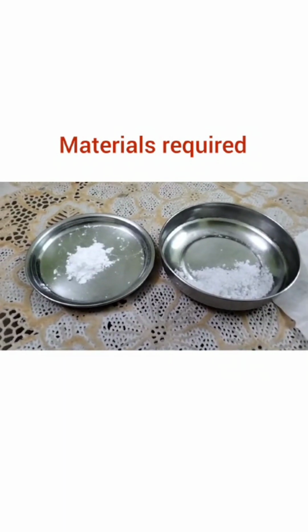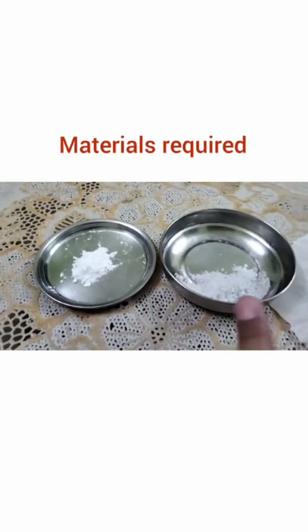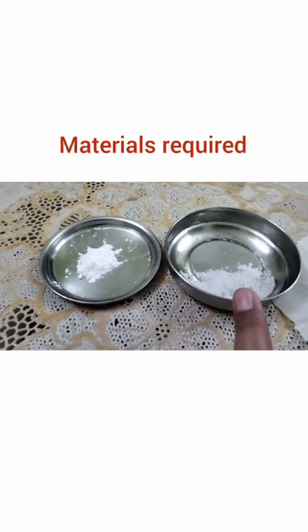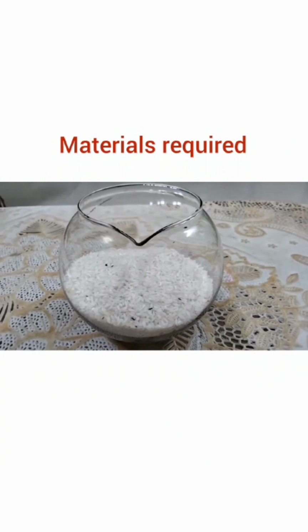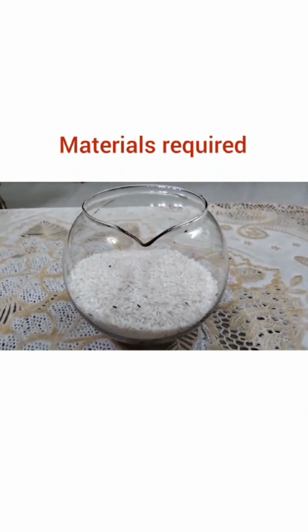Here are the two chemical insecticides, one boric powder and one camphor powder. This is the rice infected with Sitophilus oryzae, commonly known as rice weevils.